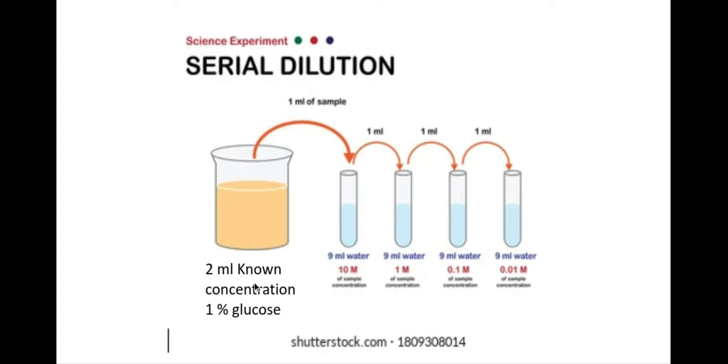For example here, I've been provided with two milliliters of a one percent glucose concentration. I need to make several different concentrations from this. So what I do is I take half of that out, so one mill, and pop it into the test tube.